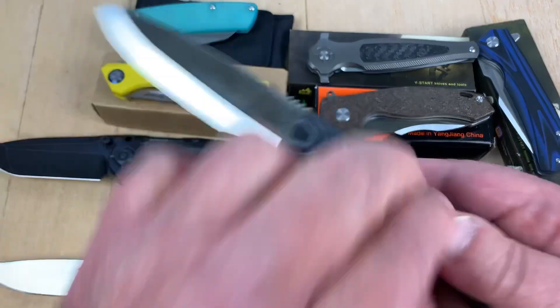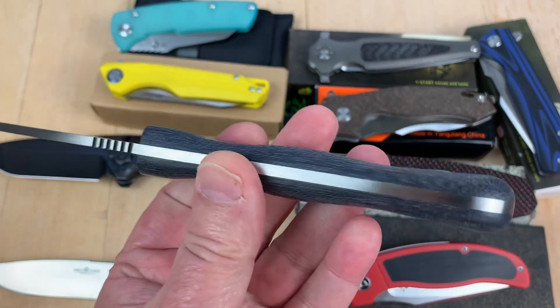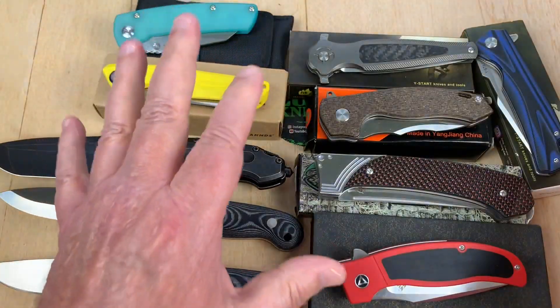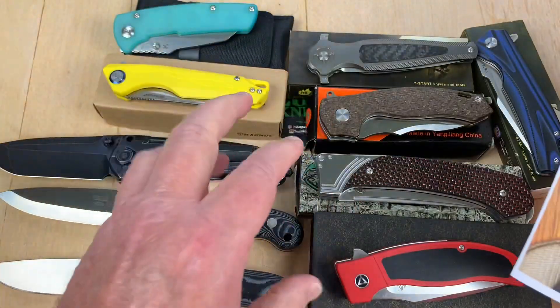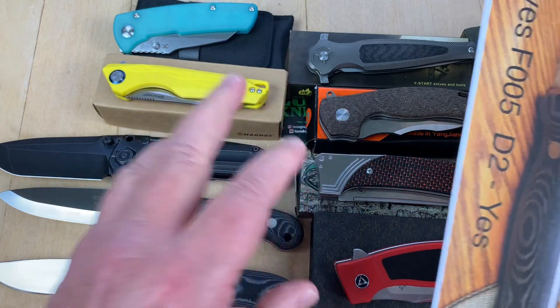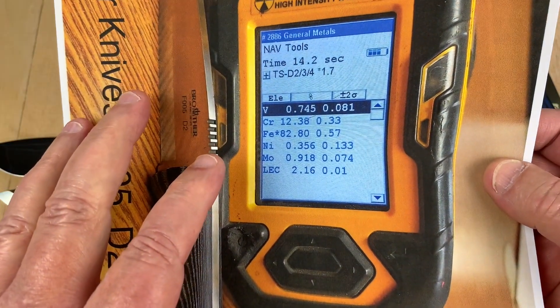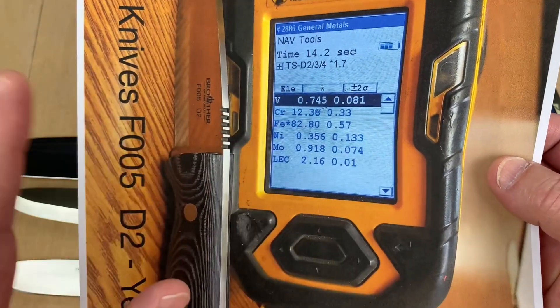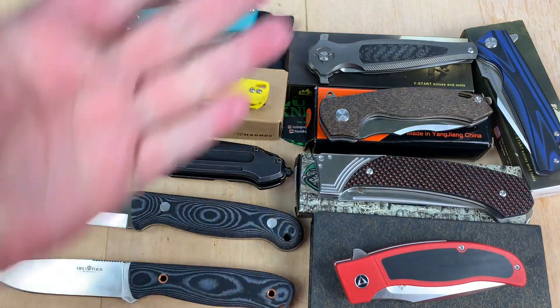The next one — most of the Brother fixed blade knives are claiming to be D2, and this one has some heft to it. Is it real D2? Yes, it is. Their D2 is real D2. Their VG10 is real VG10. 440? That's just weird. D2 is a 12% chromium product, and there it is. Your vanadium sometimes runs between 0.3 and up to 1%. The analyzer gun did indicate it's D2, so it's D2.